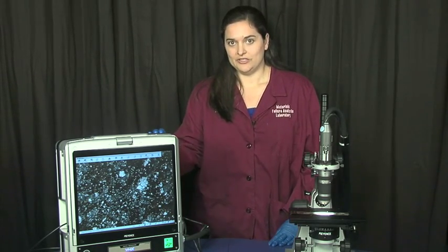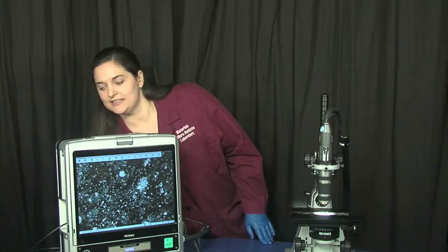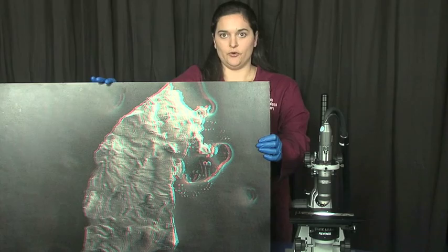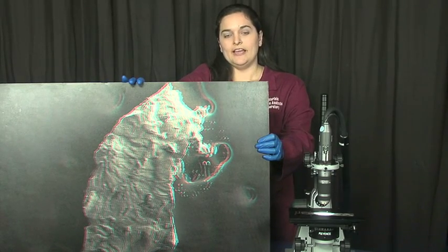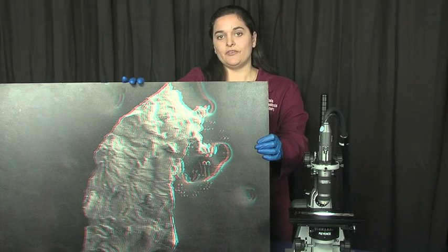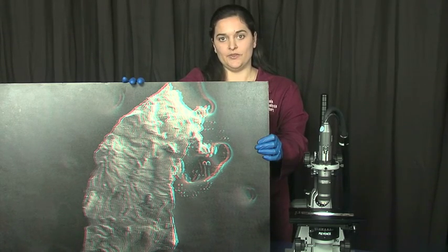We were also able to determine, using pictures like this, this is from a scanning electron microscope. And like I was telling you before, it uses electrons instead of light to see things, and we can use magnifications 100,000 times better than the human eye.